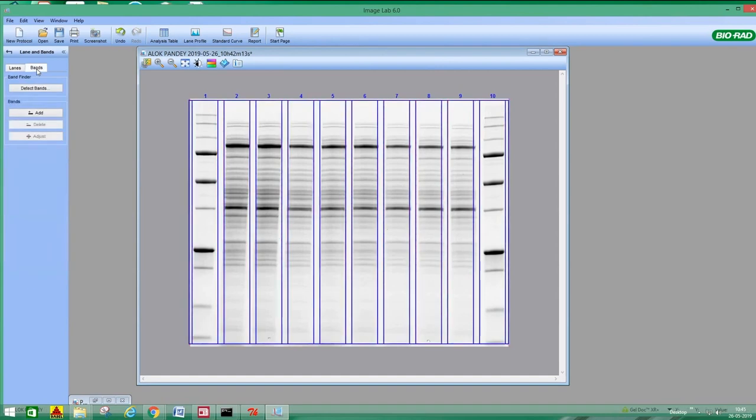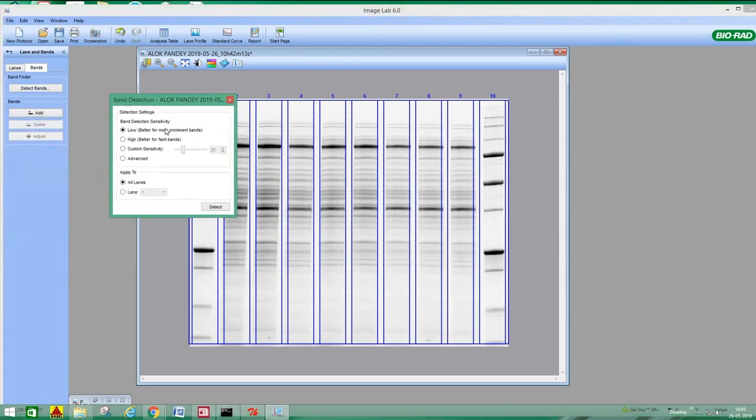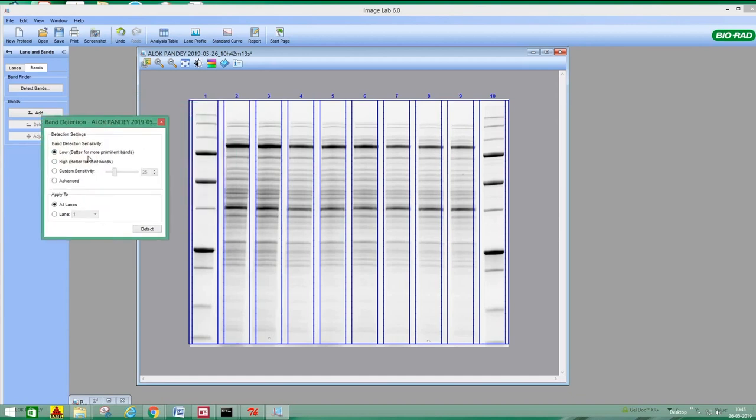Next, after identifying the lanes, you have to go to bands. How many bands are there? You allow the software to detect the bands. Here a few options are there. Band detection sensitivity, one is low. Low means better for the most prominent ones. If you keep it at low sensitivity, it will detect only prominent bands, which the software can observe based on intensity. Otherwise, you can select high sensitivity, which means it will select faint bands also, as you can see it has written here. Or you can manually select sensitivity. So I am asking high, better for faint bands. See how it will do.